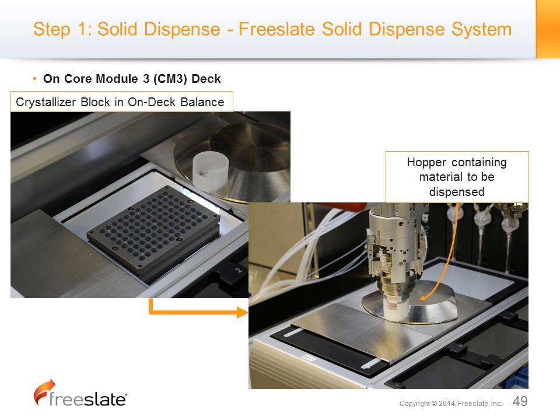In this particular case, we use a hopper. With the hopper, you can see this is where you pick from the deck the individual coformers, to be dispensed onto this. You have to close the shields for the balance.